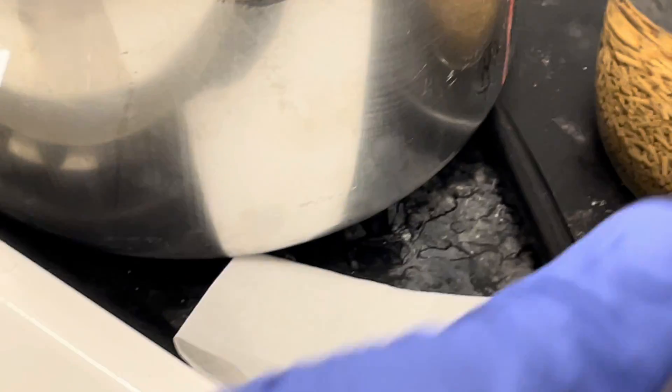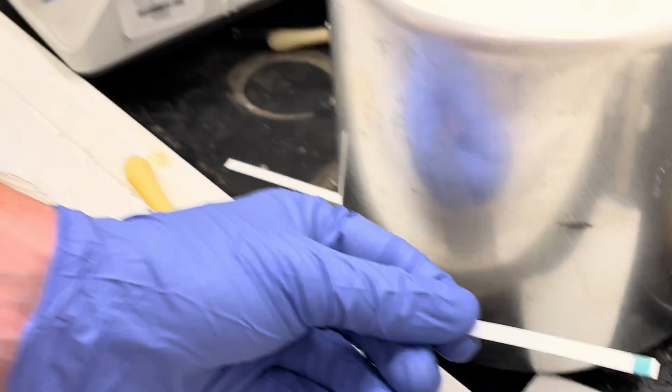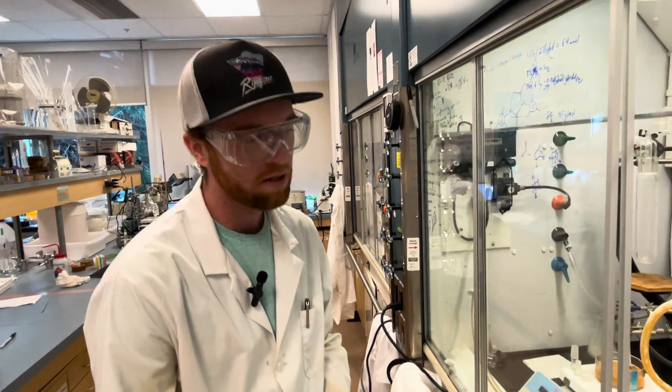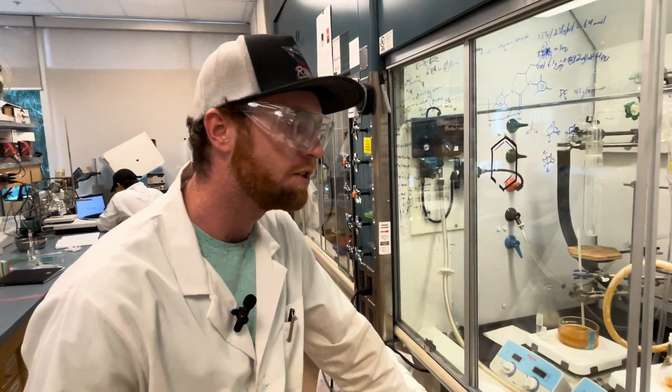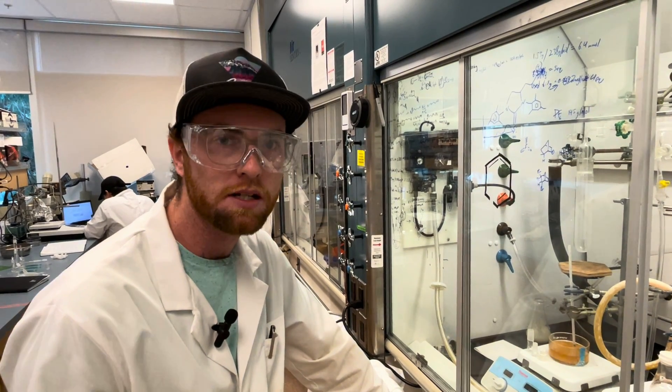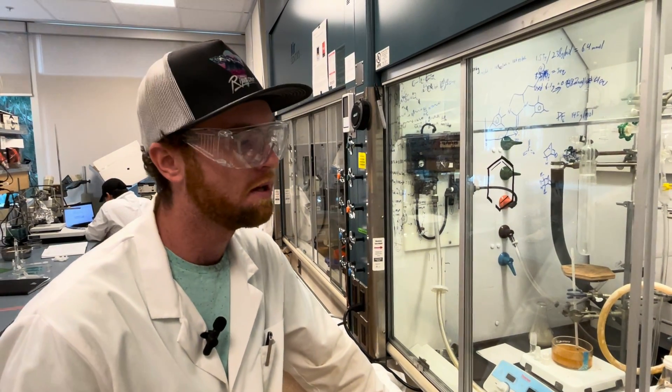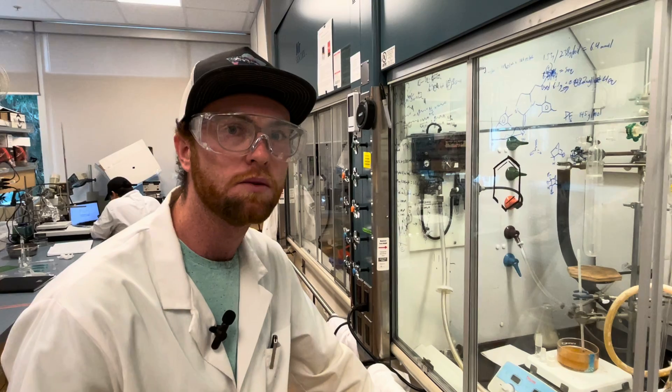So our tetrahydrofuran is giving us a pretty positive peroxide response, what that means is that this solvent should not be distilled, it should either be disposed of or have its peroxide quenched in some way before use, ferrous sulfate is typically the way that this is done.